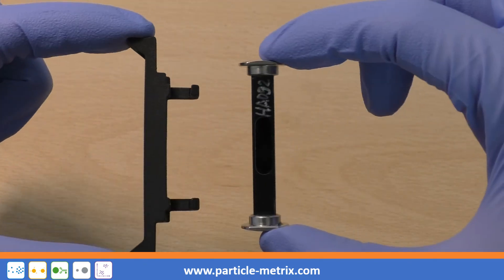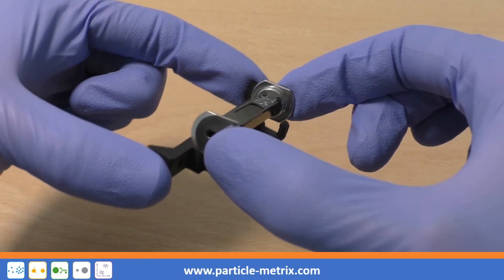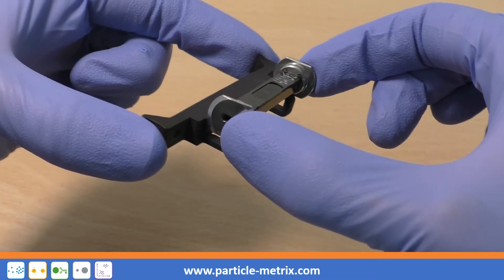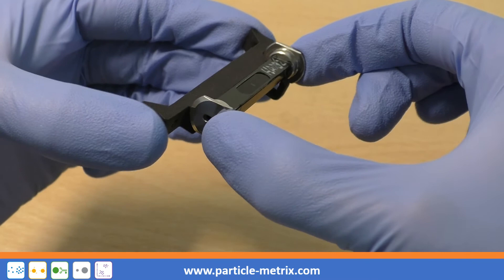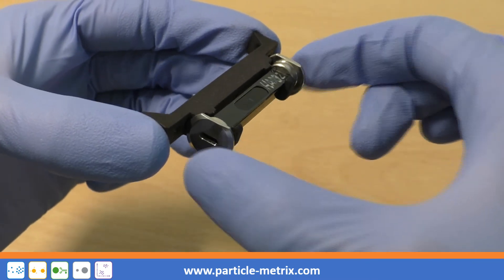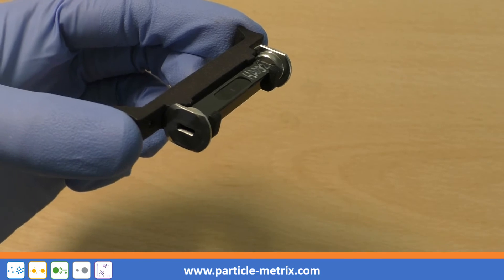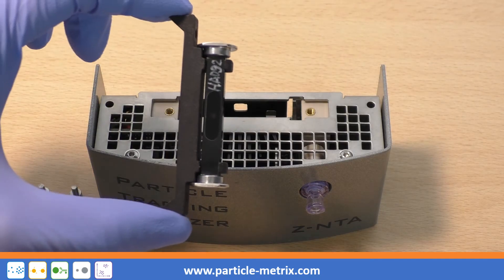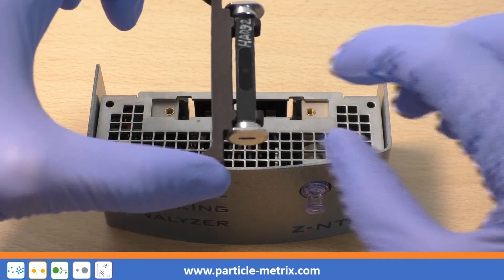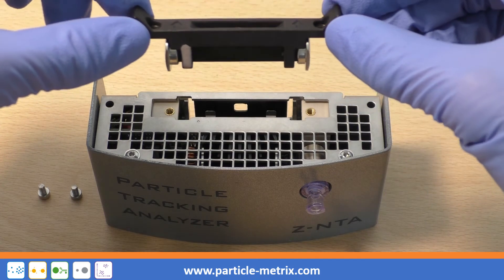Insert the cell into the cell carrier so that the optical window for the microscope is facing the openings of the two retaining clips of the cell carrier. Insert the cell so that the serial number and the optical window are aligned with the back of the cell assembly.